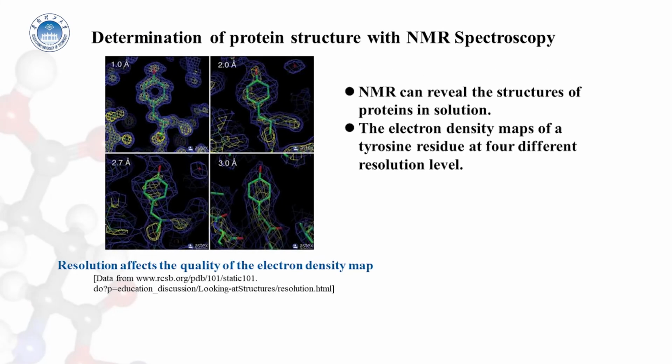Then nuclear magnetic resonance, NMR spectroscopy, is unique in being able to reveal the atomic structure of macromolecules in solution, provided that a highly concentrated solution can be obtained.